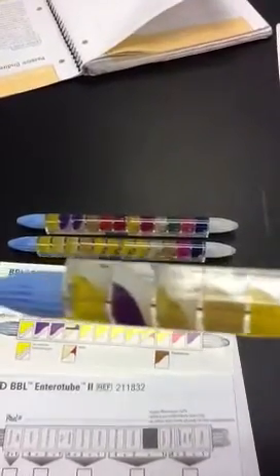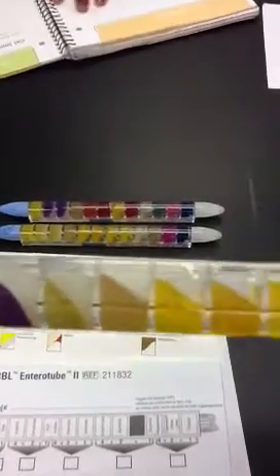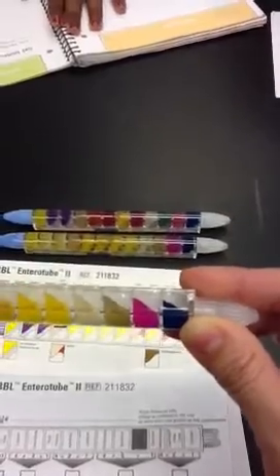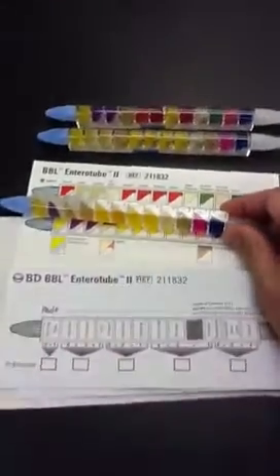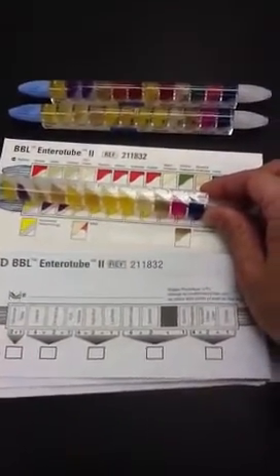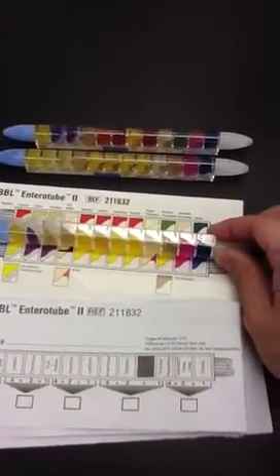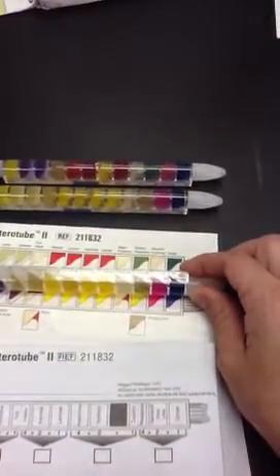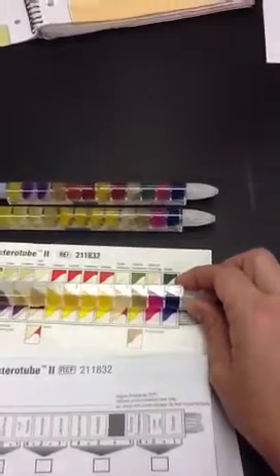Oh, she's got a bunch of stuff set up over there, too. Oh, look. They actually show how they have the bubble. How come she's not taking the picture? What's the plate of the soil plates, do you think? Should I identify the different types of colonies? Probably, or at least know what's going to grow on what type of agar, because there's glycerol yeast, there's... I think there's a few different patterns.